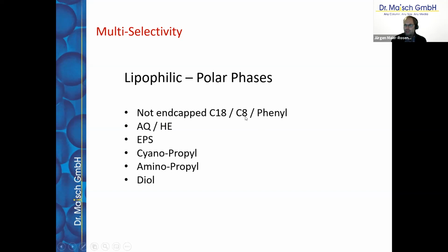The other possibility is to go to a C8 phase, and the C8 phase has 2 possibilities of interaction.